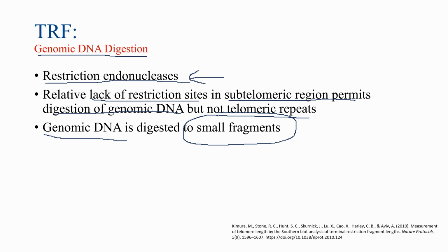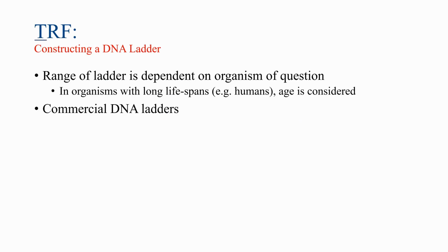Of course, when you are performing the analysis part of your TRF, you'll account for these subtelomeric regions, which are constant in length, relatively speaking. An important step in TRF is the construction of your DNA molecular weight ladder.